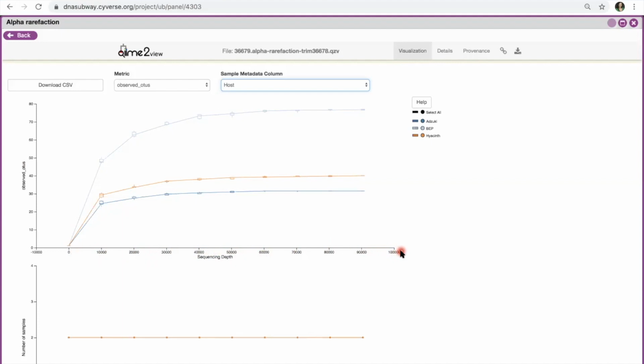So essentially what rarefaction does is this mathematical process that takes all of the sequences from all of the samples, randomly draws a sequence, keeps track of which samples that sequence was found in, and stores it in memory. And then it randomly draws out another sequence and compares it to that first sequence. And if they are identical, then they're probably going to be classified as the same type of bacteria. So even though there's two sequences, that's just one bacterial type.